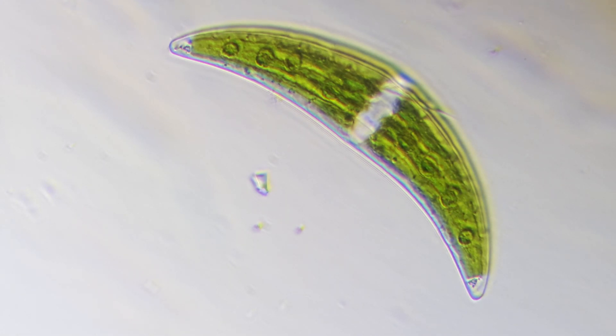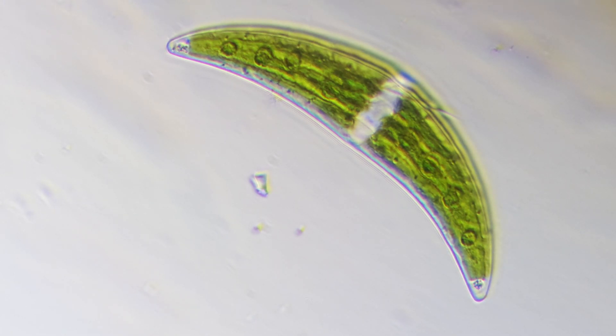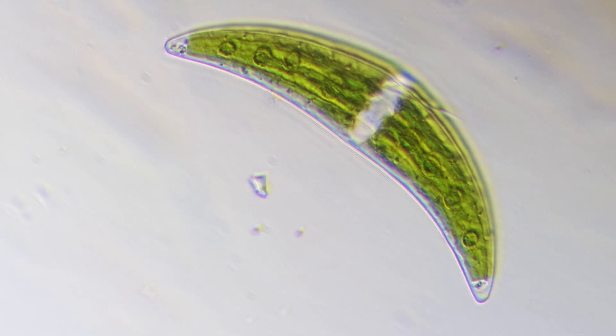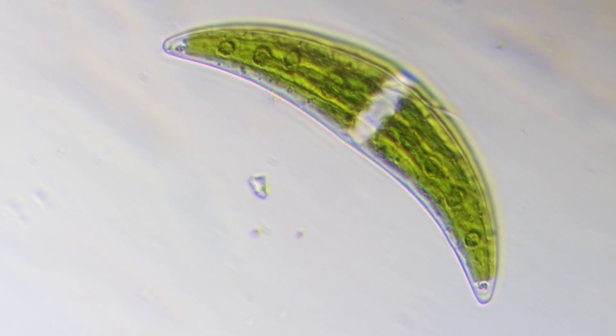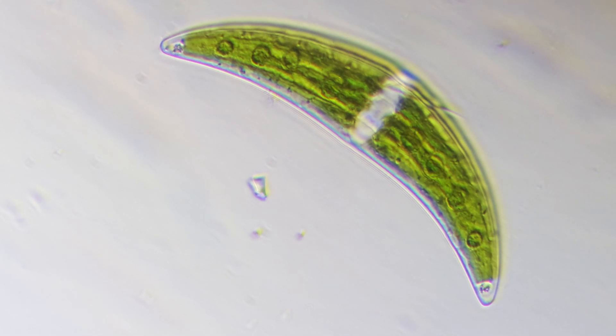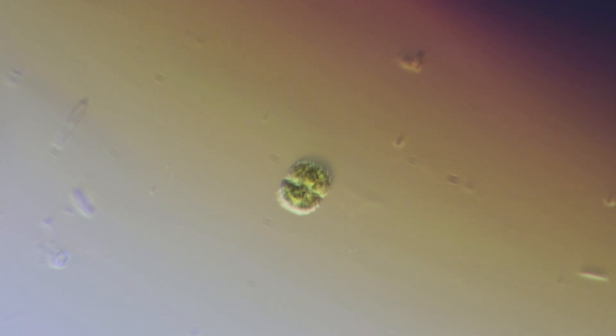This one seems relatively content to sit in place, which may be simply because it is pinned between the narrow space of the slide and cover slip. Certainly if you notice its size compared to the other plankton and microorganisms around it, the Closterium is huge, at least on the microscopic scale. Ultimately Closterium is a desmid, a relatively common form of algae that live in fresh and salt water that are noteworthy for their beautiful shapes and symmetry.